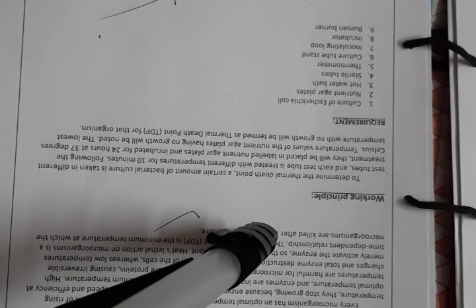So what are the requirements of the thermal death point experiment? First of all, we need the E. coli culture, or the bacterial culture. And then we need a hot water bath, and a few test tubes to give them the hot water bath. How many test tubes do we need? We need the number of temperatures we are going to give. Here we are going to give from 50 to 100, so 50, 60, 70, 80, 90 and 100. So there would be 6 test tubes.